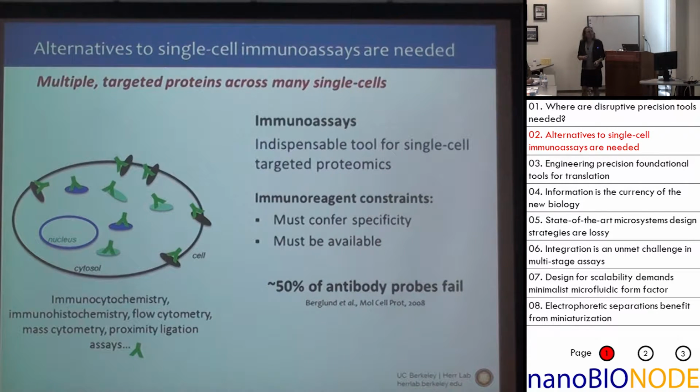And what you can see is that in this particular cell, we've stained that cell with an antibody. So we performed an immunoassay. It's green, which indicates it has some sort of fluorescent label on it, let's say. And we see that this particular antibody not only recognizes the P185 transmembrane HER2 protein, that's this black oblong here, it also recognizes the truncated isoforms that are in the cytosol, and it turns out it recognizes another protein that we have no idea what that protein is. It's a cross-reactive signal.